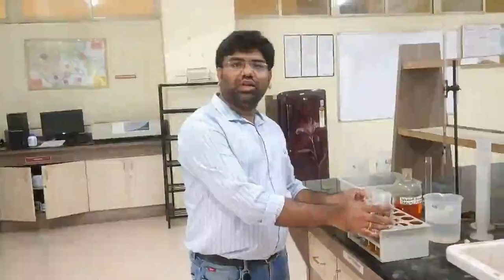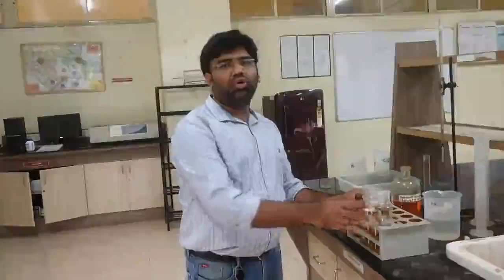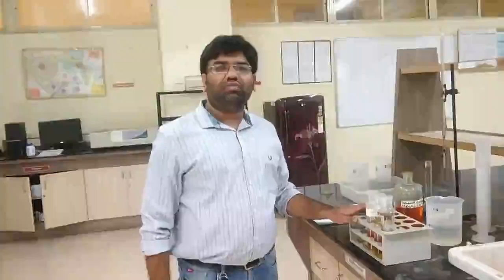So we have added all the chemicals here. The next thing is that they have told us to add 2 to 3 glass beads. So why is the addition of glass beads there?